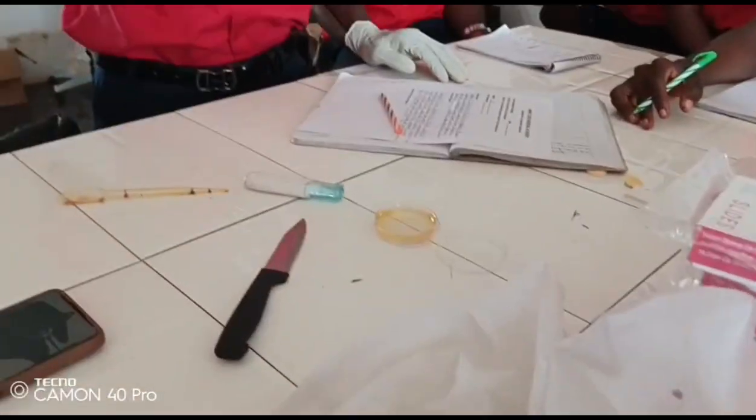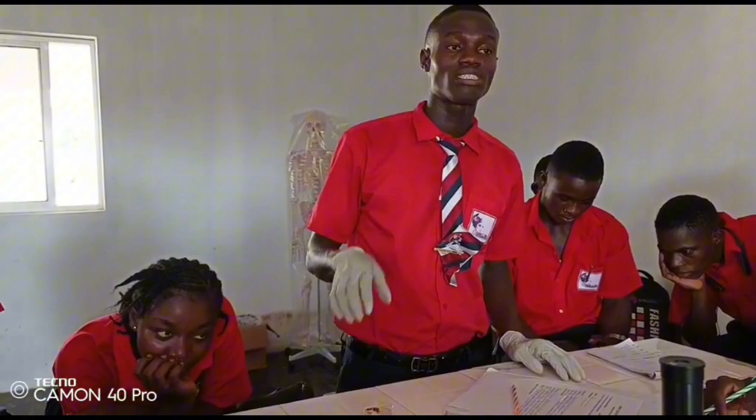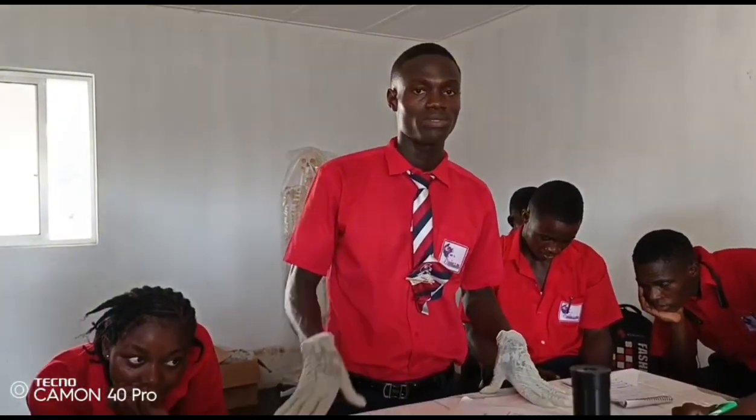Then we tried the iodine on our plantain in the petri dish, and the color of the iodine changed to black because the plantain contains starch. Then we carried on our observation and conclude with the presentation we came here for. So once again, I'm Prince Gabo.